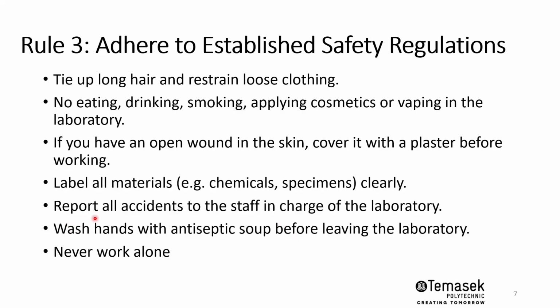Report all incidents to the staff in charge of the laboratory. This could be your supervisor, or it could be your lecturer or tutor in the laboratory. Before you leave the lab, it's good practice to wash your hands with antiseptic soap, and never work alone. Always work with a buddy or someone in the lab.